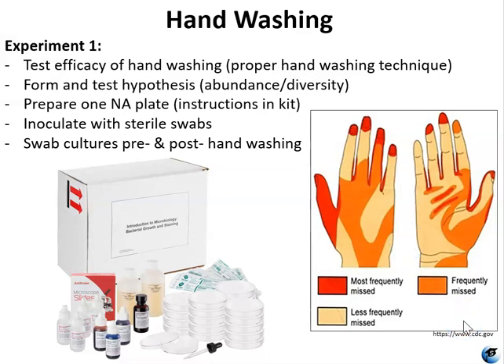And then you want to dry your hands with paper towels. If you're ever given a choice, say in a public restroom, between paper towels and an air dryer, you always want to pick the paper towels, because an air dryer, especially the ones in public places, is going to blow microbes right back onto your clean hands.